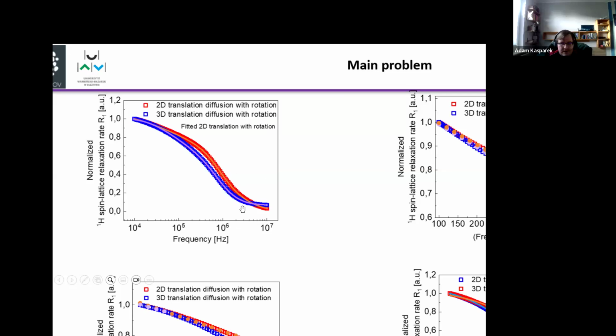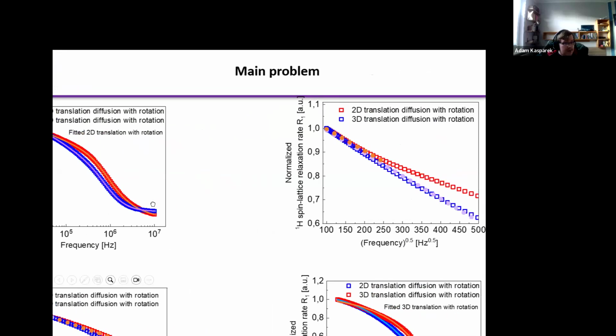Of course, it's not perfect, but it looks good at first glance when we have the results. So the first thing we do is try to fit two models, and we can see, oh, they are fitting, and then we have actually fitted the wrong model.